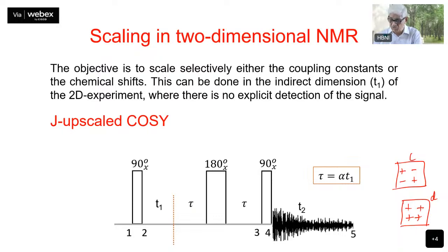In the double quantum filtered COSY, in DQF COSY, we had this sort of a character for both diagonal and cross peaks. We had this character in both, and they all had the same absorptive line shape. Therefore, this resulted in a substantial improvement in the resolution. Subsequent to that, we also did what is called the constant time experiment, constant time COSY, this is CT COSY.